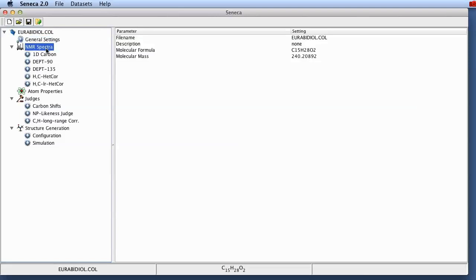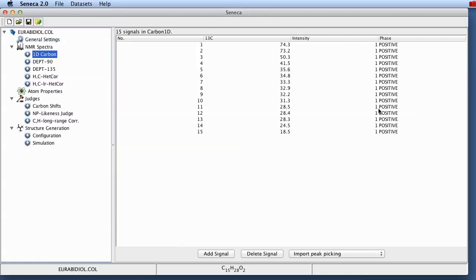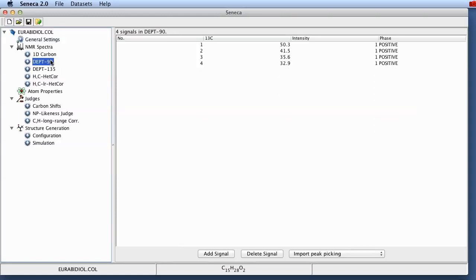Then next you see a set of NMR spectra. We've got the 1D carbon NMR containing 15 signals, a set of ppm values for all these signals, an intensity, in this case this is all one because we've extracted this from the experimental section of an article and we've got all positive phase of the signals. The phases are important in the next two cases.